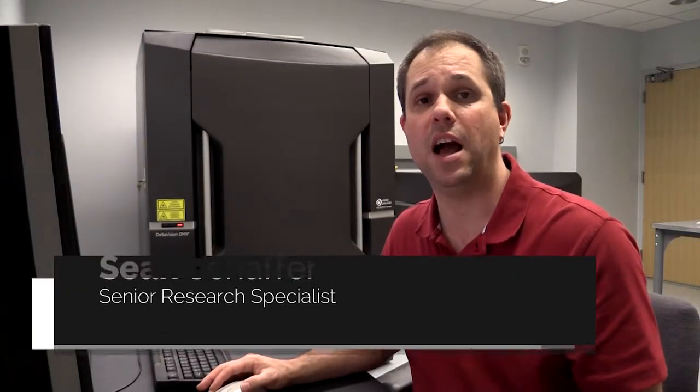One of the keys to collecting high-quality SIM images on the OMX is to make sure that you're matching the index of refraction of the oil to the sample. It may take several tries before you get this correct, but it's vitally important that you do. An oil of 1.516 is often a good place to start.